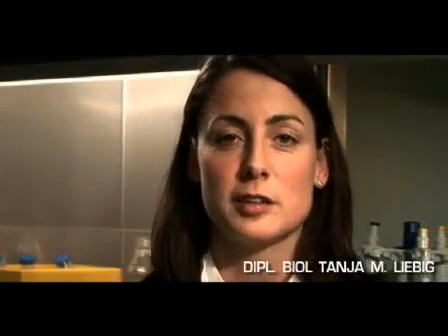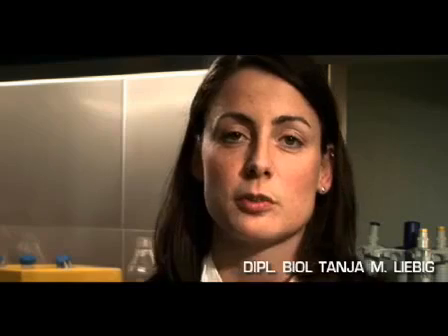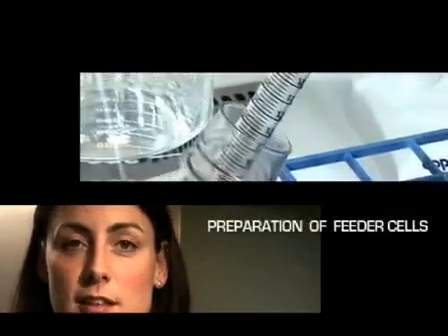I'm a PhD student and I want to demonstrate to you how to generate human CD40-activated B cells. This procedure was optimized in our lab. The main steps are: first, the preparation of feeder cells.